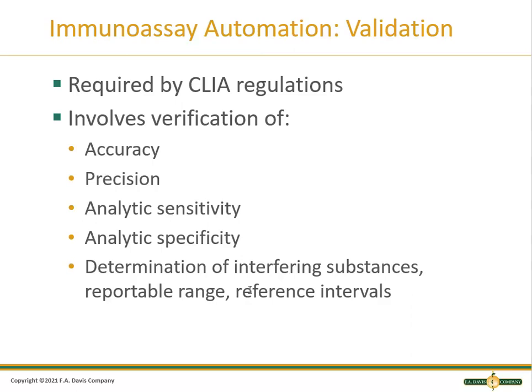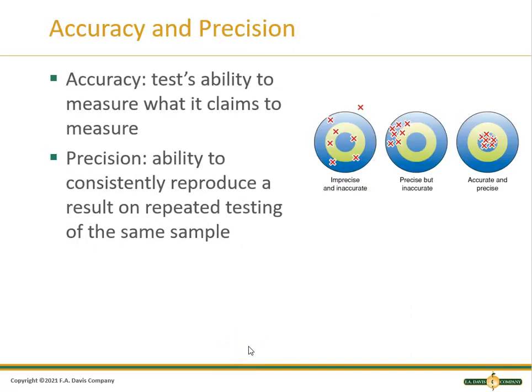Usually the manufacturers of the companies that make these instruments do all that for you. They do all that validation study for you when they set the instrument up, because it is very time consuming to do. It's a whole bunch of stuff you have to go through.